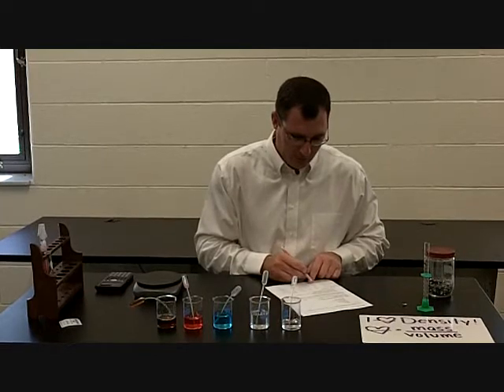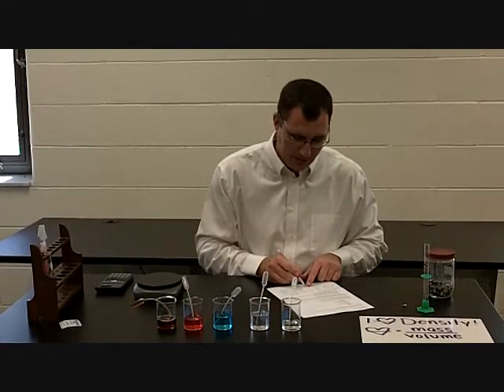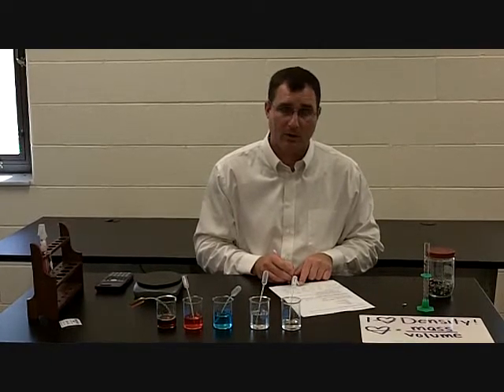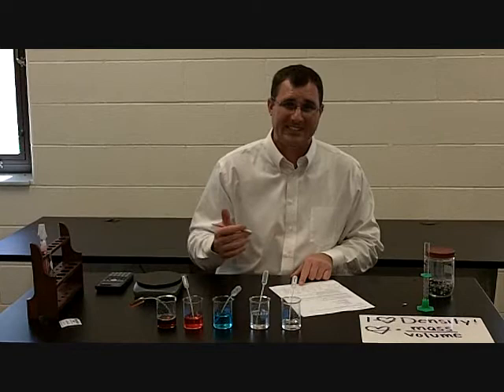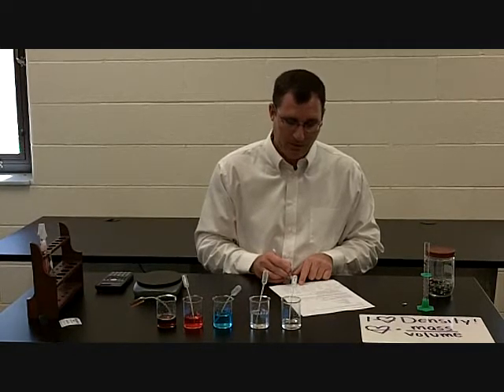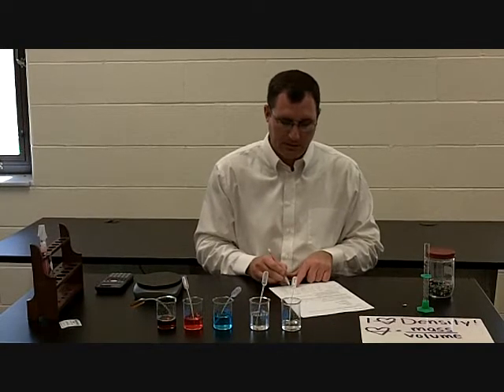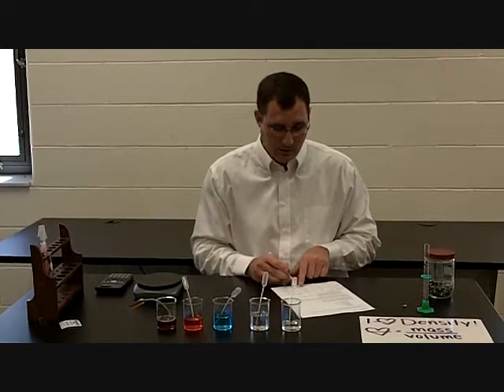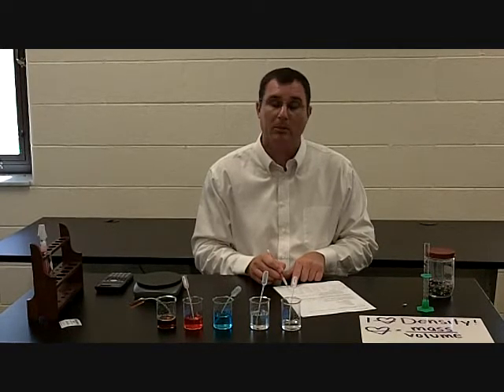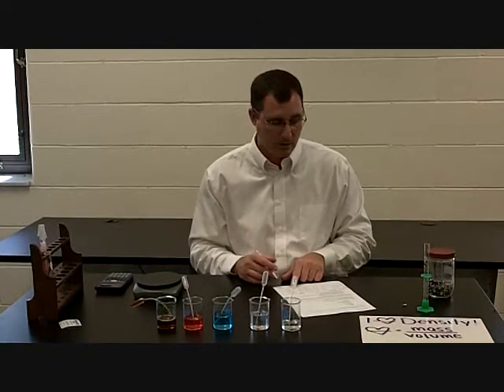Water was 5.7 grams with the pipette minus 0.9 grams for the pipette. Leaves me 4.8 grams for the water. Remember, density is mass divided by volume. So I take that 4.8 grams, I divide it by the 4.8 milliliters of volume. 4.8 divided by 4.8 gives me 1 gram per milliliter as the density of my water. And that's what we would expect to find for water.